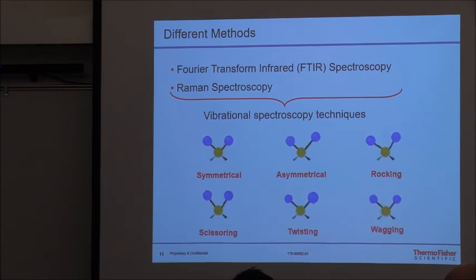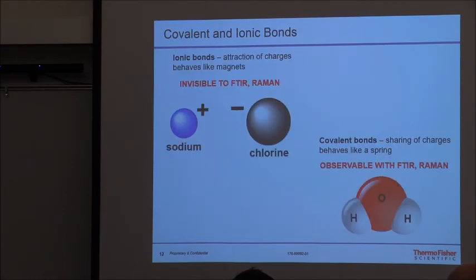And it's measuring the movement. All chemicals, all covalent bonds have different movements. And that's really what it's trying to measure. Okay? I think that's exciting, isn't it? Incredibly. Like, oh my God, this guy's an idiot, right? That's all right, my wife and kids all say that, okay?